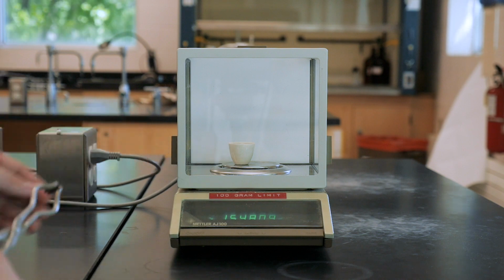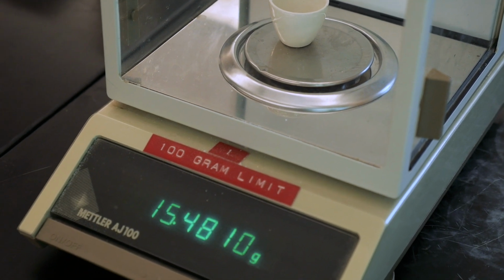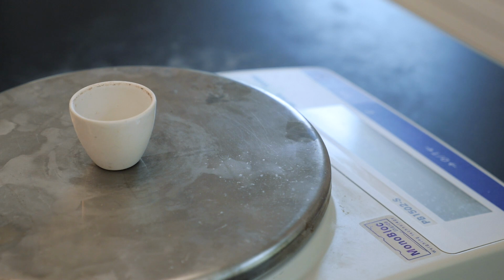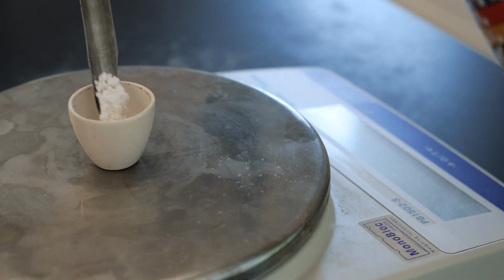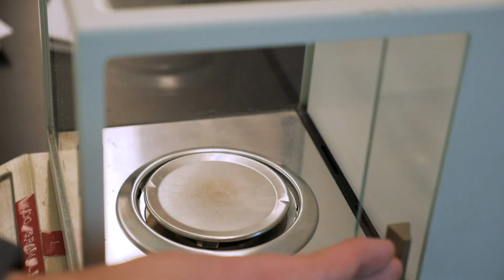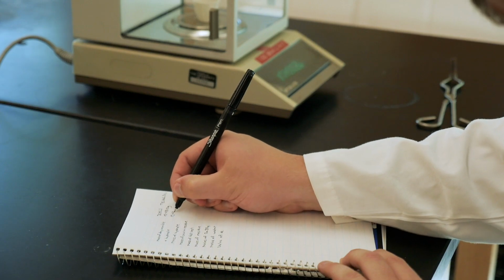One thing to keep in mind today is to always use the same balance to weigh your samples. It just removes the possibility of variance between instruments, causing any error in your measurements. Now it's time to get your gypsum sample. So tare the weight of your crucible on one of the top loading balances, then add about 2 grams of gypsum to it. You'll need to know the precise weight of your sample for this experiment, so transfer the crucible to an analytical balance and record its weight to the full 4 decimal places that the instrument reads.